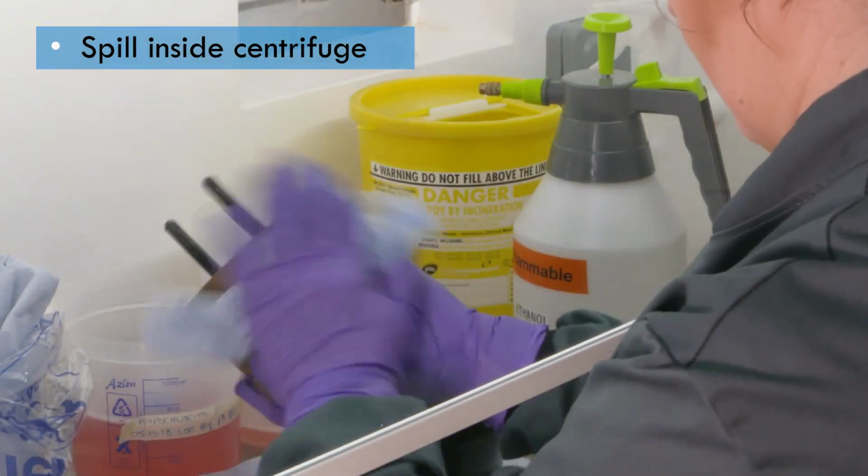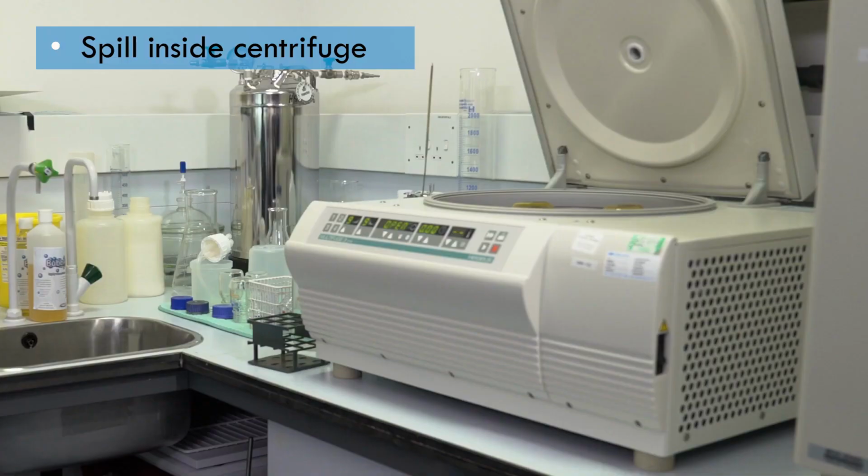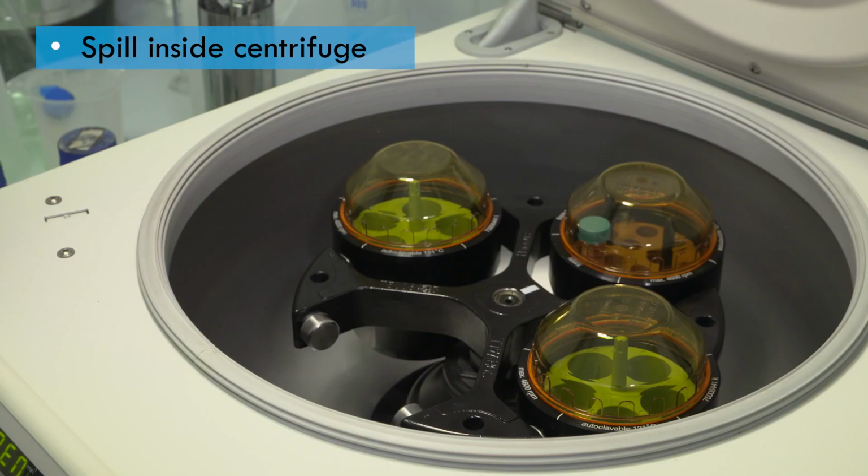Check the bucket or rotor and the centrifuge for any signs of damage. If it is damaged, ensure it's not used and contact the supplier to arrange repair or replacement. A service visit may be advisable, even where there is no obvious sign of damage.